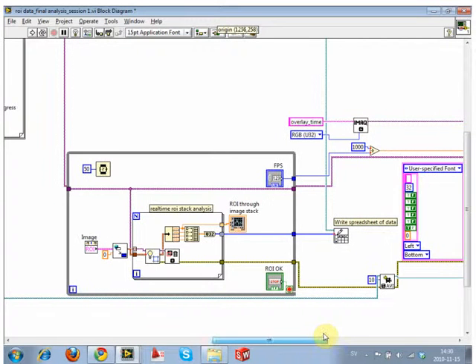Well, no, because I hadn't hit the ROI OK button. It's told to be in here. Until I hit that ROI OK button, it'll stay in that loop. If I'd hit OK, it would have run to the end and there'd just be nothing saved. It's still doing exactly what we told it, but rather than analyzing the region of interest of images, it's got no images to analyze.